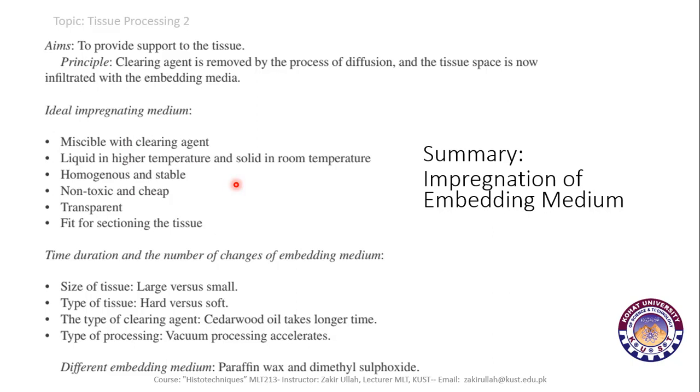This impregnating medium should be homogeneous and stable. It should be non-toxic and cheap. It should be transparent and fit for sectioning of the tissues.